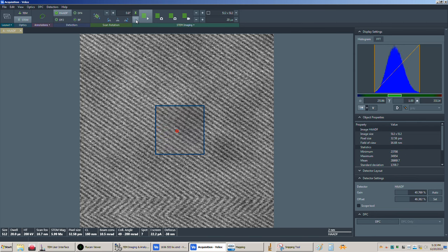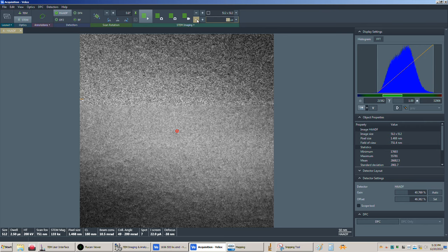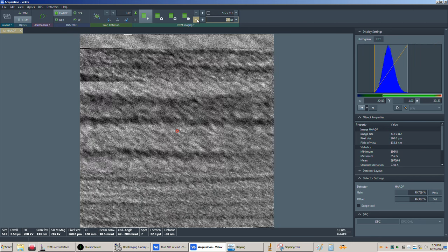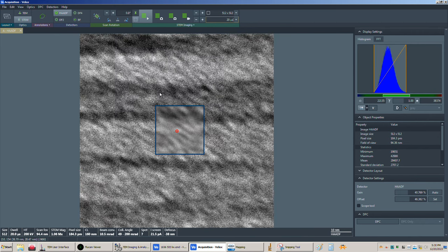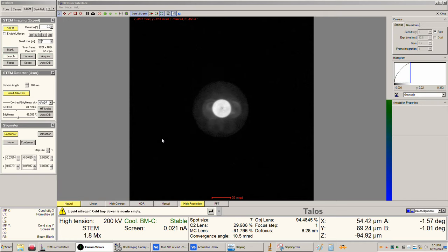All right, what we're going to have to do is go back and take a look at the Ronchigram again. Okay, what do we got here? So yeah, see, this is off here in the image, certainly. I mean, this looks fine right here. So that's why, unless there's something else going on that I don't know about. I mean, all right, let's pause this here for a second. Leave that there.